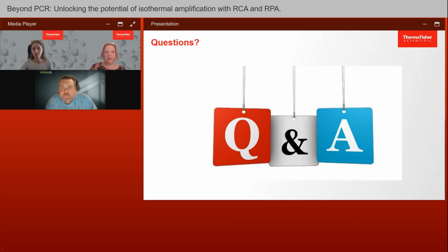But LAMP, for example, with 6 primers and quite high temperature, if well designed, can be really specific. RPA primers are also longer than for PCR, so this allows similar specificity as in PCR. Also, it can be increased by combining with CRISPR-Cas systems and similar helpers.